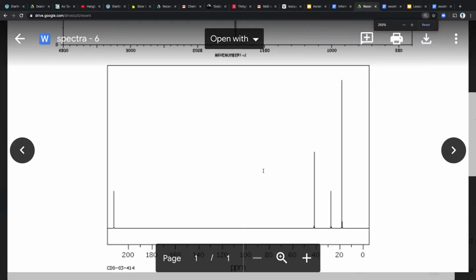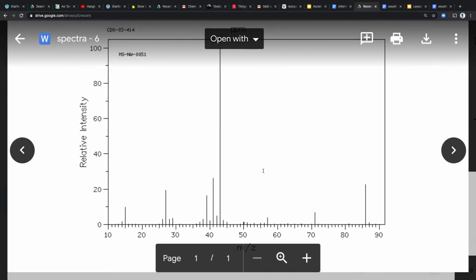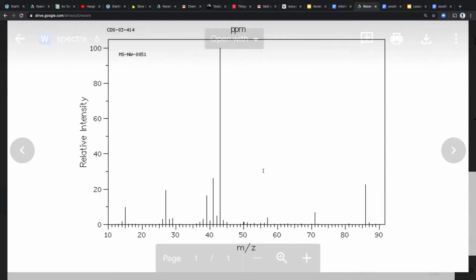But anyways, on this one here, we see the mass spec. What information can we get from that? A really obvious piece of information we're looking for right away. Yeah, Ben? The molecular ion is at 86. Correct. So we know that's going to be our molar mass. Perfect. Exactly right. And the little blip to the right is just some of the molecules that contain a carbon-13 isotope.